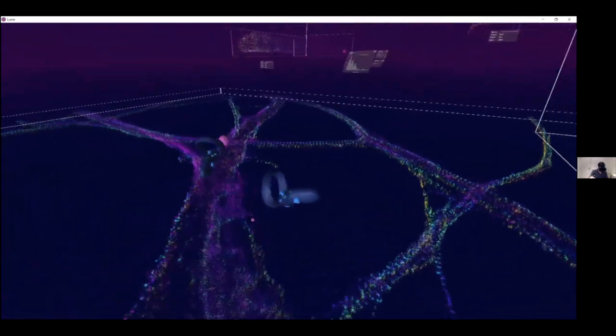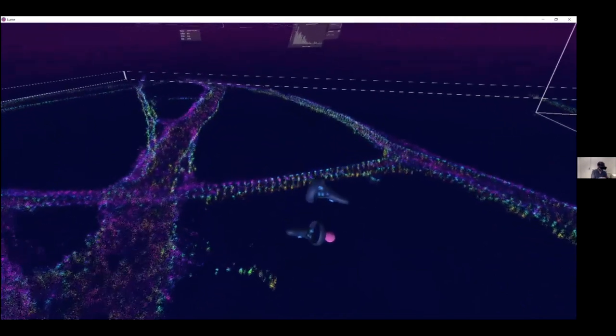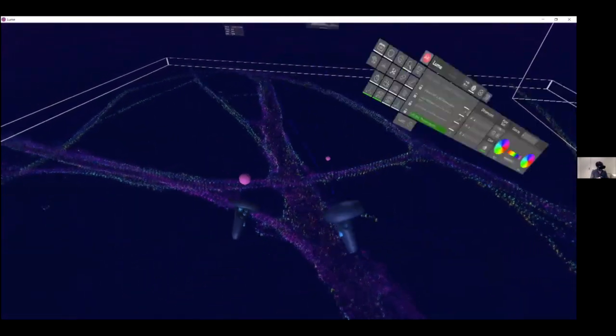And this is the axon and the spectrin rings that Steve was just talking about. So this is data from the Le Terrier lab. I'll just make it slightly bigger.